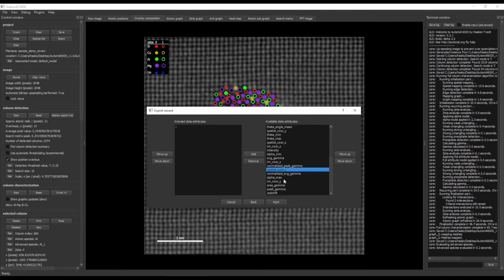And the other, core x, means image coordinate x, so that's the pixel coordinates, or relative to the pixel coordinates, but mostly you'll be using spatial coordinates. So you would add the y coordinate as well, and maybe even the z coordinate. If I could find it, that would be a really nice spatial set.